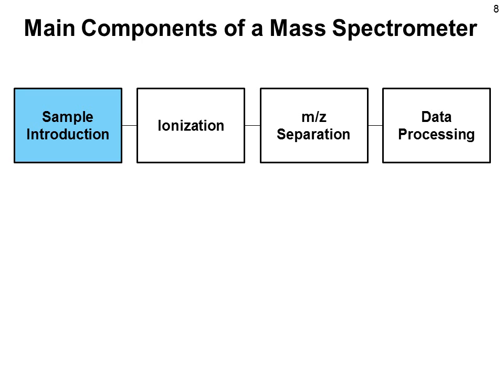So how can we get the sample into the mass spectrometer? There are a couple of principal ways. The first is liquid chromatography. This is a very powerful combination, as we can separate molecules in a complex sample first, for example by reverse phase chromatography based on the hydrophobic properties, and then introduce them into the mass spectrometer one after the other.